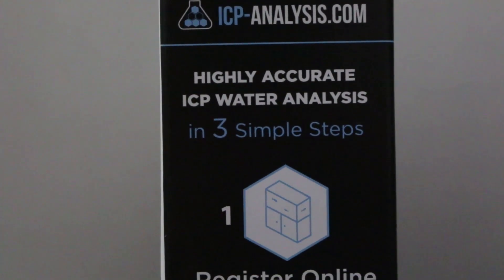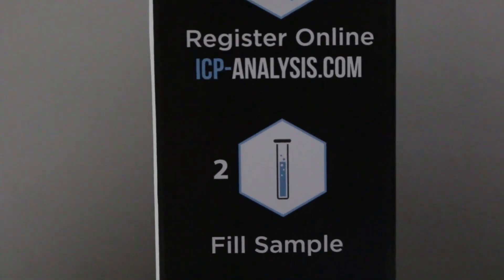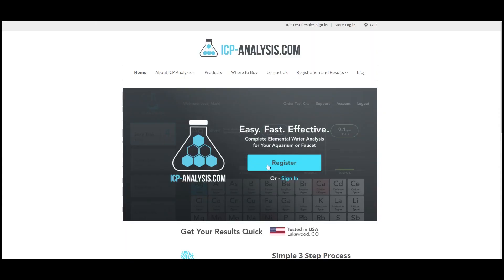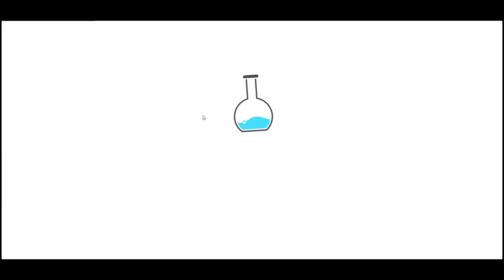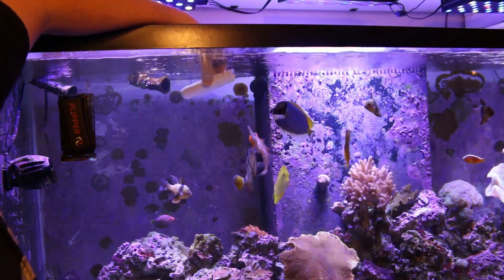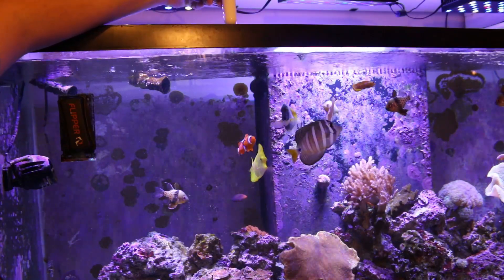Once you get the ICP test kit here by Coralview, it's very easy to do. All you need to do is go to their website, create an account, and log in. Once you do that, you'll get a unique code to put on your water sample when you send it in. To get your water sample, you simply just take the container, dip it down into your water, fill it up with water.